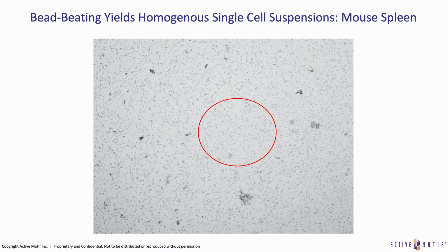At this point, it is a little bit difficult to tell whether we have a single cell suspension or a nuclear isolation because there's no unhomogenized control that I can really put on a hemocytometer. So we have to do some further studies to figure out exactly what these membrane-bound bodies are.